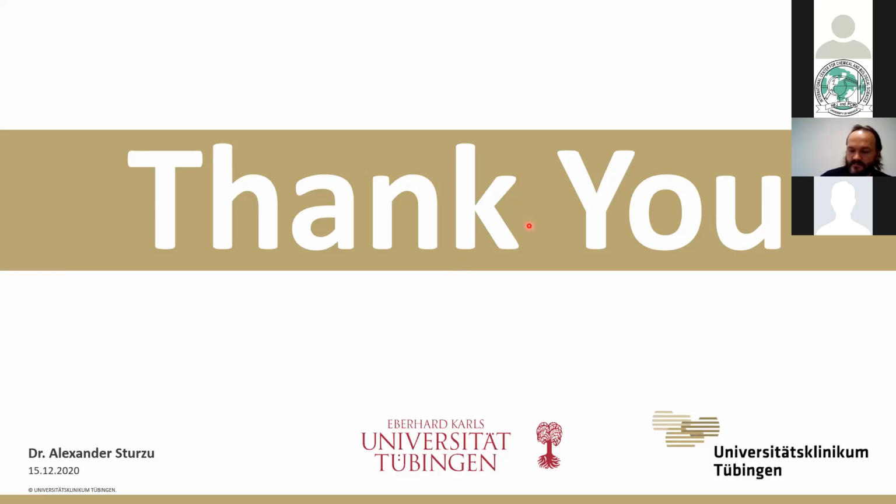So what is the difference between A2 and B2 safety cabinets? Oh, this is a technical question. I'm afraid that I'm not versed on this technical part. Okay, so when someone is acquiring safety cabinets, not only the company, but the specific parameters, if you can explain a little bit about it. Again, I'm not that well versed with the technical aspect of the materials and the machines, so I really can't help you there. As I said, what's important is that the air filtration is a given. I'm really sorry, I can't help you more with this.